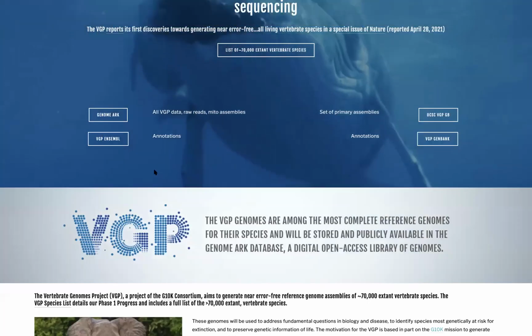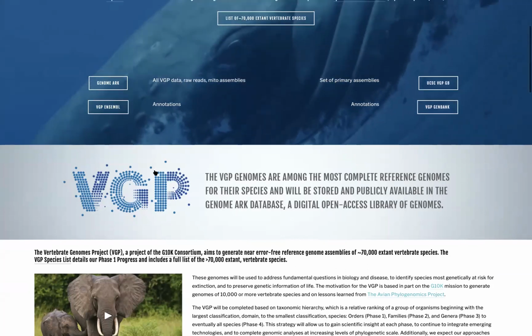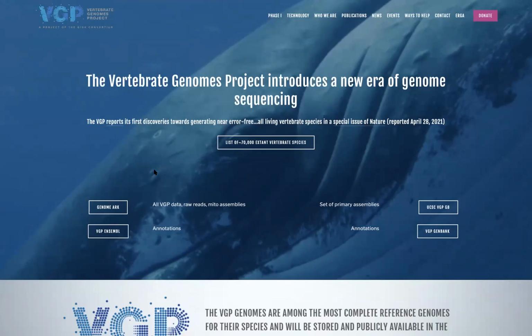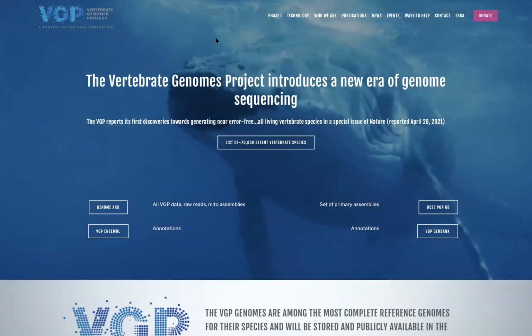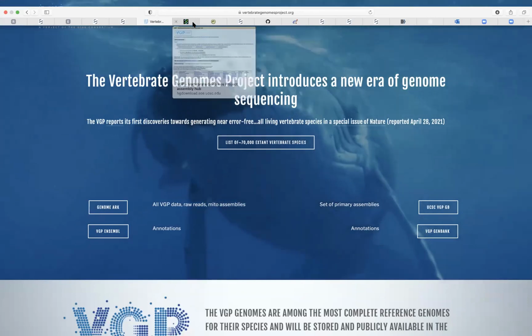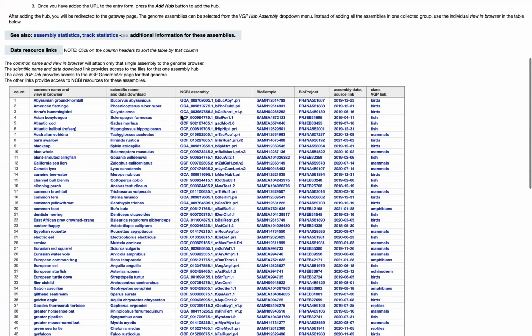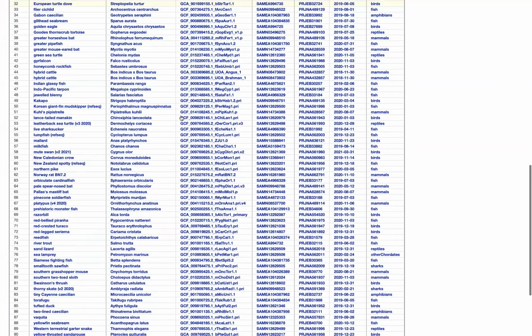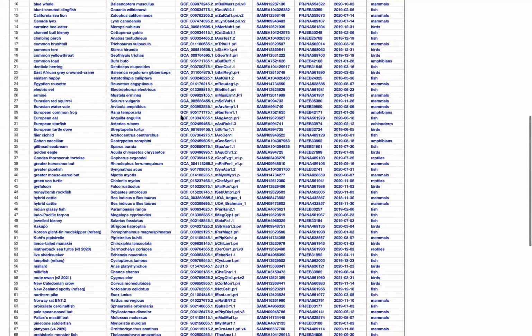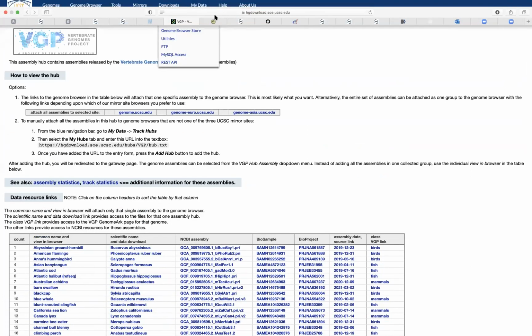We have the Vertebrate Genome Project. So we have a vertebrate genome laboratory here at Rockefeller. They're associated to this massive consortium, the Vertebrate Genome Project. So they're real experts at building genomes in general. If you ever wanted to build your own genome and there aren't any in these reference genomes available, you can see that they've got a lot of experience building all these different genomes, sequencing, and they have this technology and some of the bioinformatics to assist you in doing this.